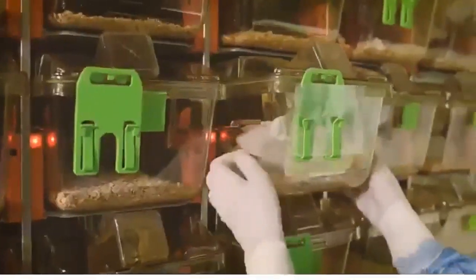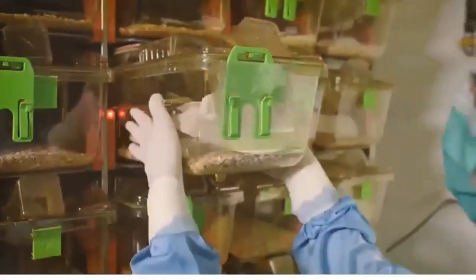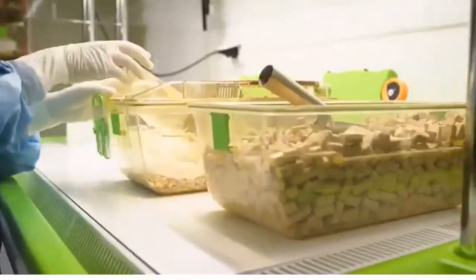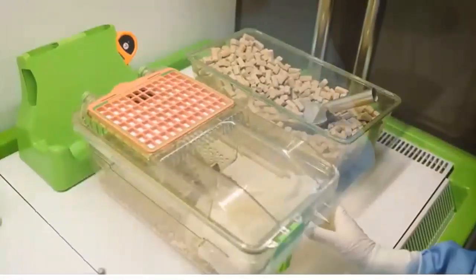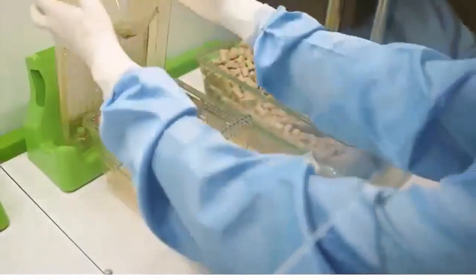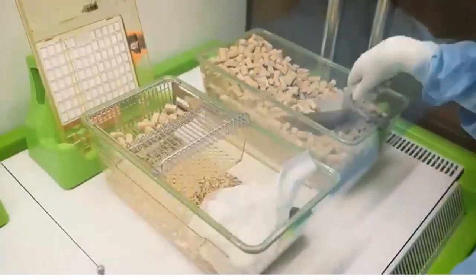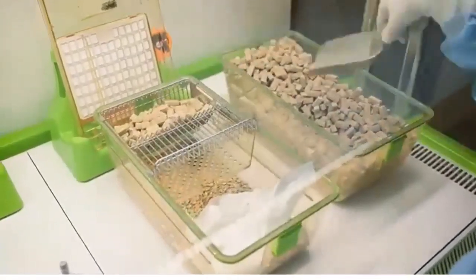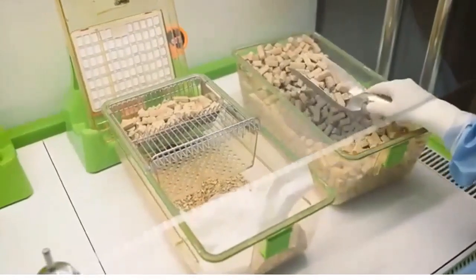In this following cage, the cage went into alarm for low food. In this specific cage, the ACT will replenish the food and place the cage back in the rack. Once the cage is placed back in the rack, the system will recognize that food was replenished, same as the missing bottle alarm. The system will clear the alarm for this cage as well.